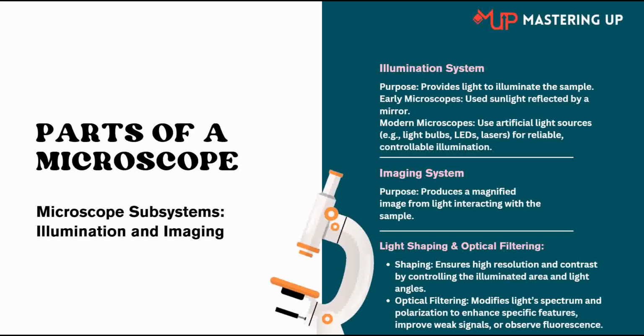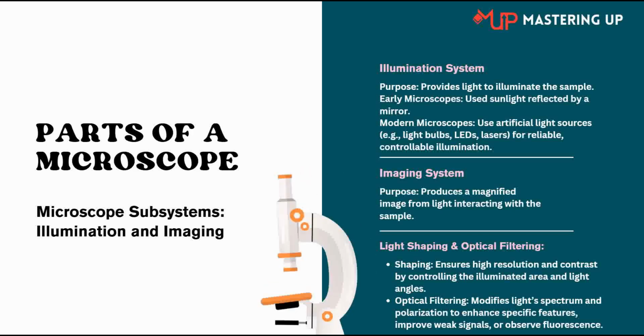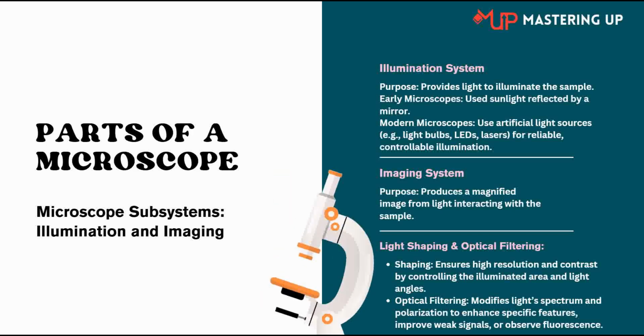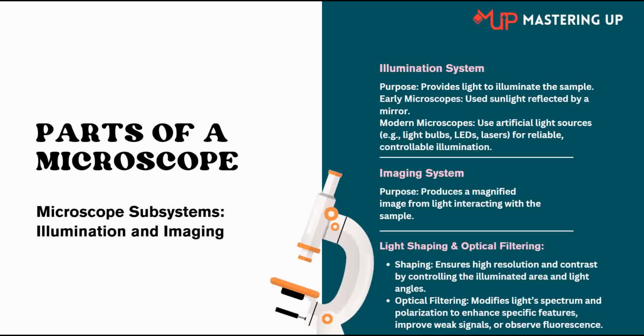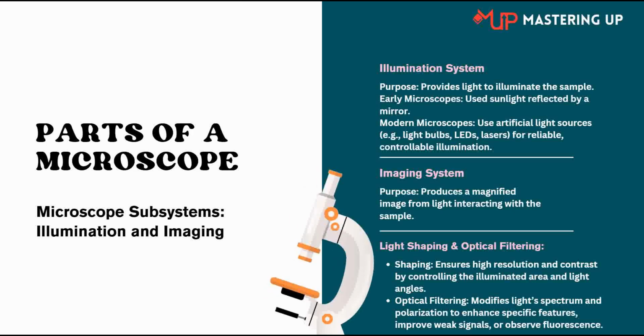Light shaping and optical filtering: light shaping ensures high resolution and contrast by controlling the illuminated area and light angles, while the optical filtering modifies the light spectrum and the polarization to enhance specific features, improve weak signals, or observe fluorescence. All these were modified in the modern microscopes.